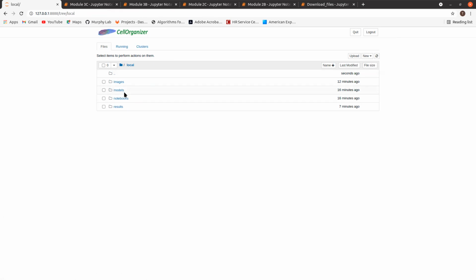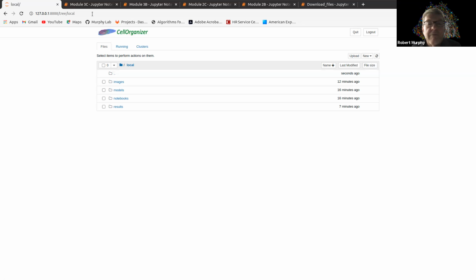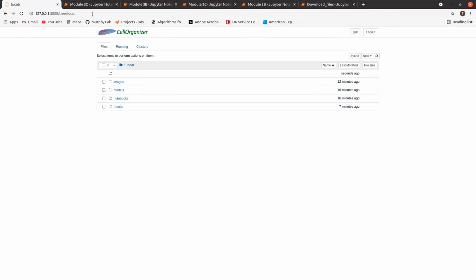It runs whatever your current cell is. If you want to run the whole notebook, you have to do Cell, Run All under the Cell menu. I find it. Okay, I got it, thank you so much. So that's why it's not doing anything, it was waiting for me. Yeah, I agree that's just the weird thing about notebooks, that it doesn't run the whole thing, just the current cell. Thank you so much. Sure.